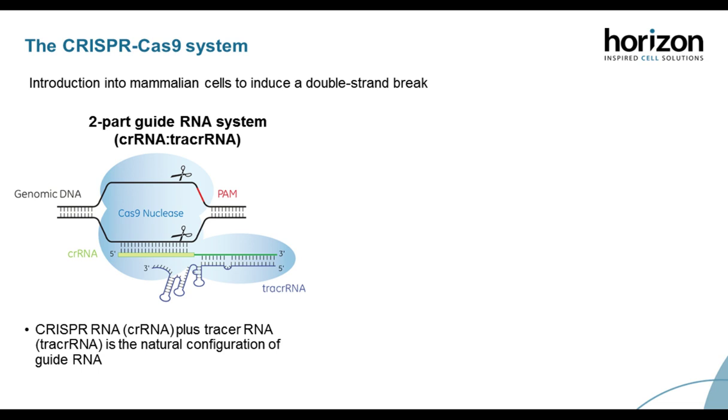Generally speaking, the adaptation of CRISPR-Cas9 has two forms. The first system that we see is on the left, and this has the Cas9 nuclease displayed in blue. This acts as scissors to cut the DNA, and the Cas9 protein is complexed with two small RNAs: the CRISPR RNA, often shortened to crRNA, displayed in yellow, and the tracrRNA in purple.